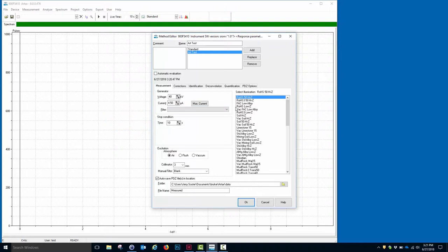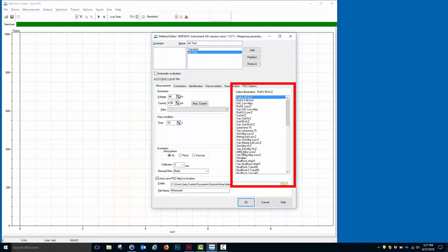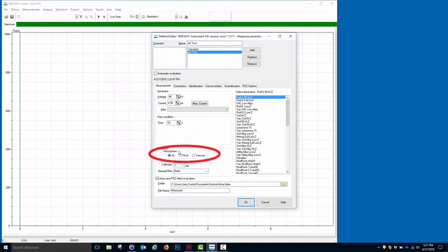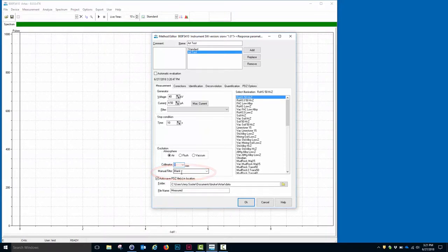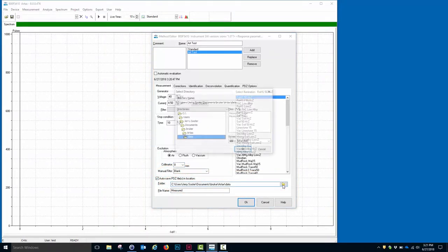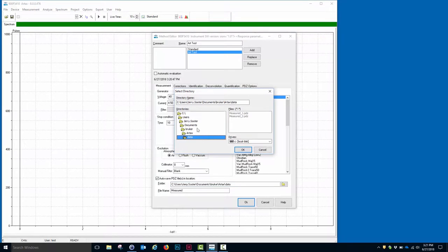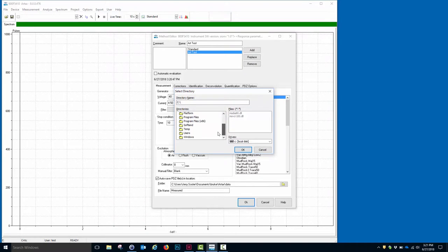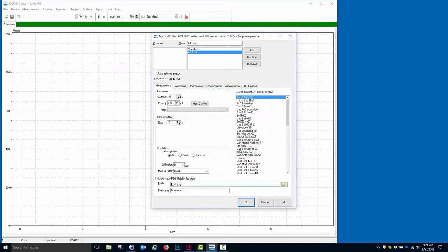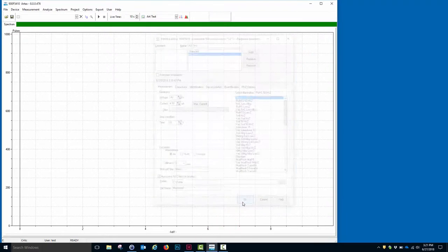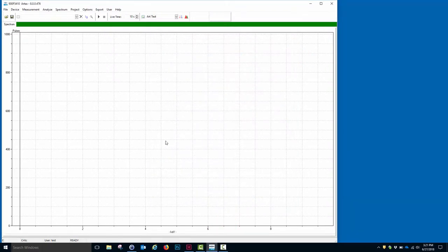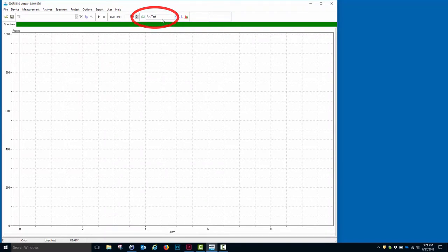Or I could simply select one of the pre-programmed illuminations which were loaded from the instrument when the connection occurred. In addition, I want to note the atmosphere that I'm using, the collimator that I'm using. In this case, I'm using an 8mm collimator. And the manual filter. In this case, it's blank. Finally, I want to select the directory where I'm going to save my data. In this case, I've got a directory I call Temp, which I will select. And we have a root name for the data acquisition. At this time, I simply click Replace and OK. I now see that the method I'm using is called Art Test.